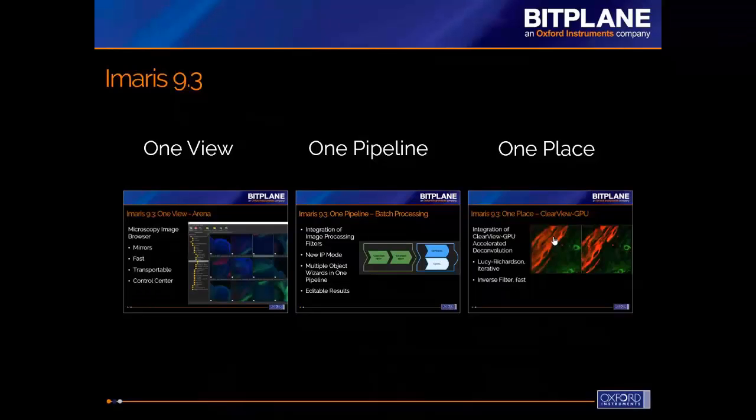We also know that everyone has their own way of organizing their data. As you sit down and organize your file structure, either on your Windows machine or on your Mac, you have a specific way of naming your images and your folders and organizing your experiments and either the treatments or the genotypes within those.